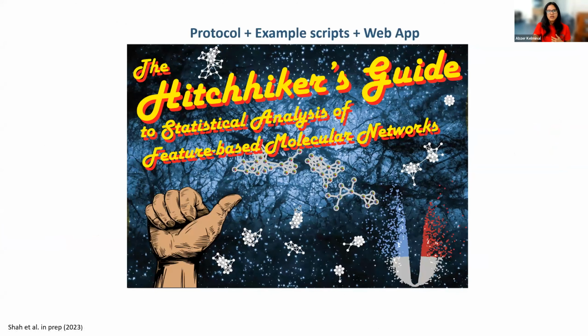So the idea is that we wanted to build a workflow that is beginner friendly for the users to perform their downstream statistical analysis after feature-based molecular networking. With this aim, last year we started this work. It started as a simple one, but ended up as this huge work.